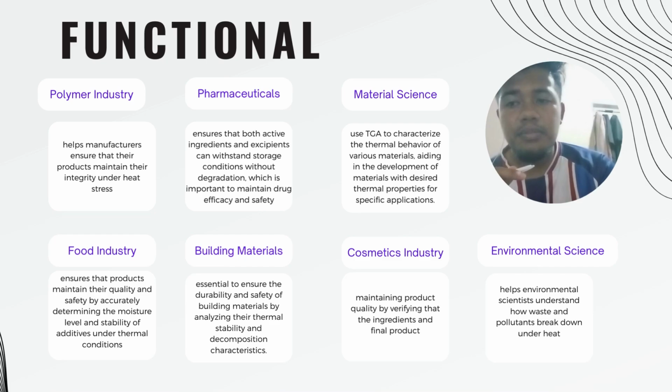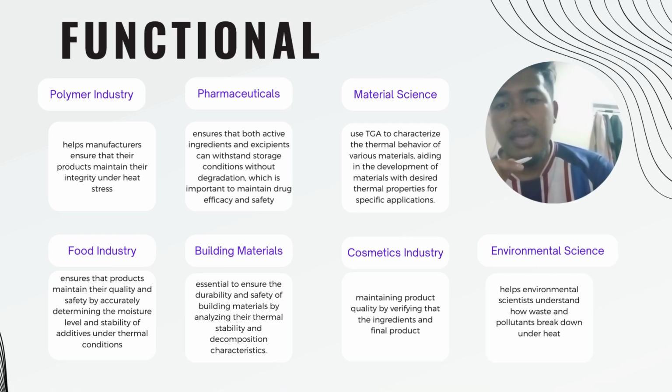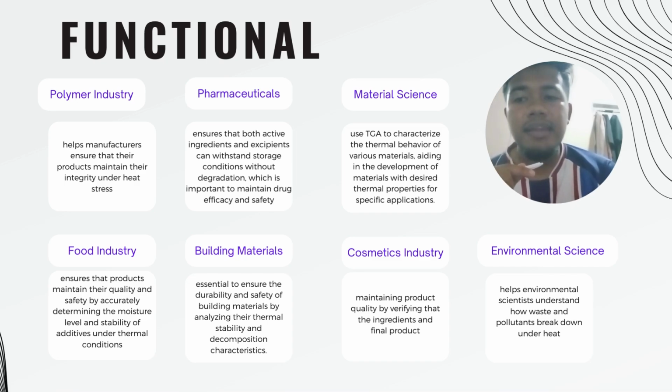Lastly is building materials. TGA is essential to ensure the durability and safety of building materials by analyzing their thermal stability and decomposition characteristics.